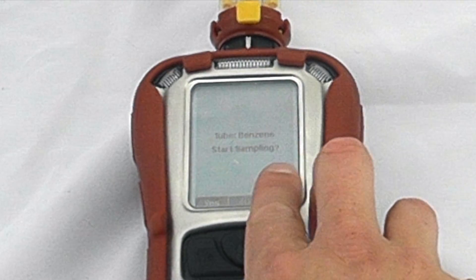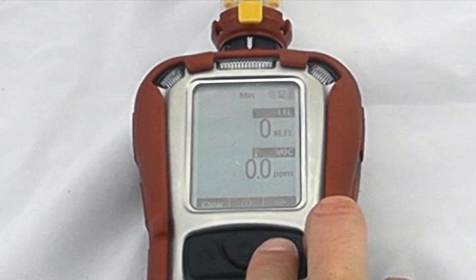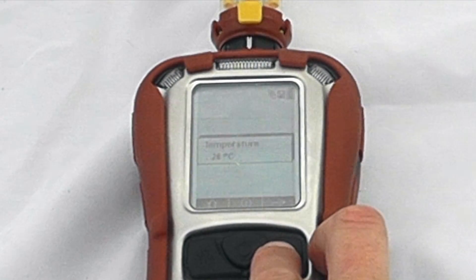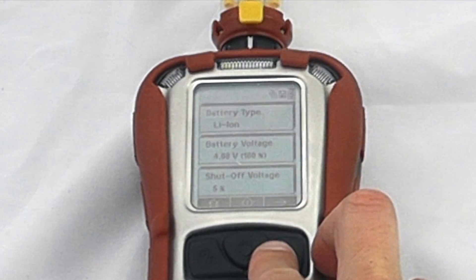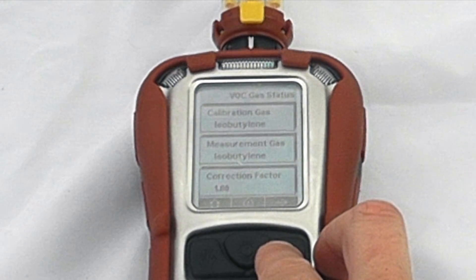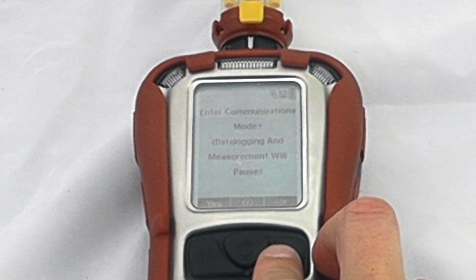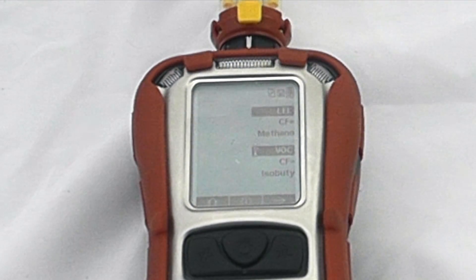We can scroll through to start a STEL and start the benzene sampling, scroll across to see any peaks, minimum, short-term exposure level if you've had enough time, and a predicted time-weighted average, time and date settings, temperature of the instrument, the battery type installed — we can see we've got a lithium-ion battery and our shutoff voltage — the current run time, previous run time, calibration gases and correction factors, same for the LEL gas, and enter communication mode if we want to communicate with the software or with an Auto-Cal calibration station.